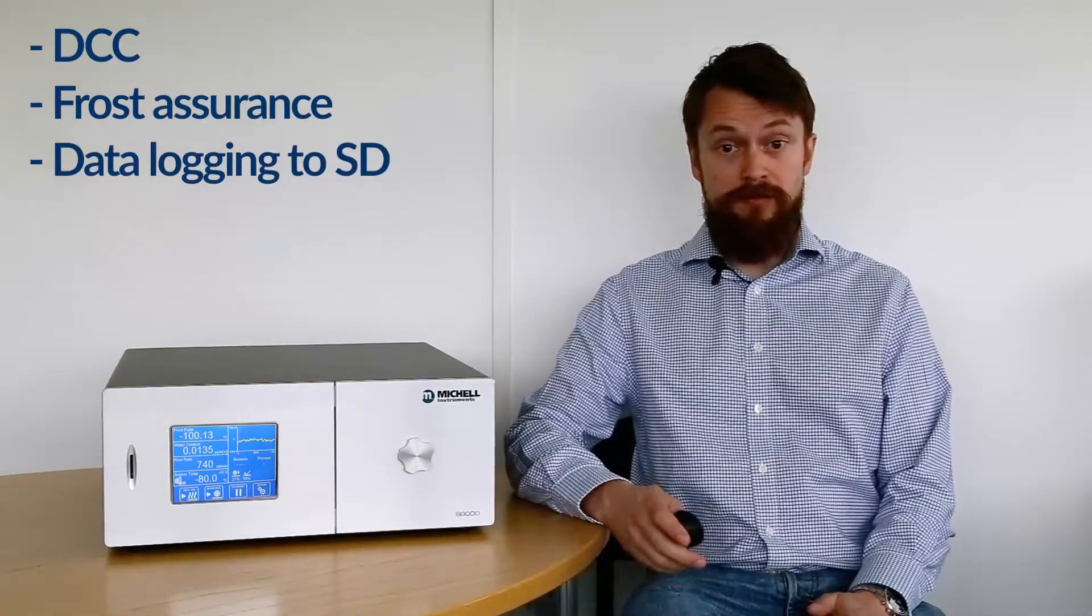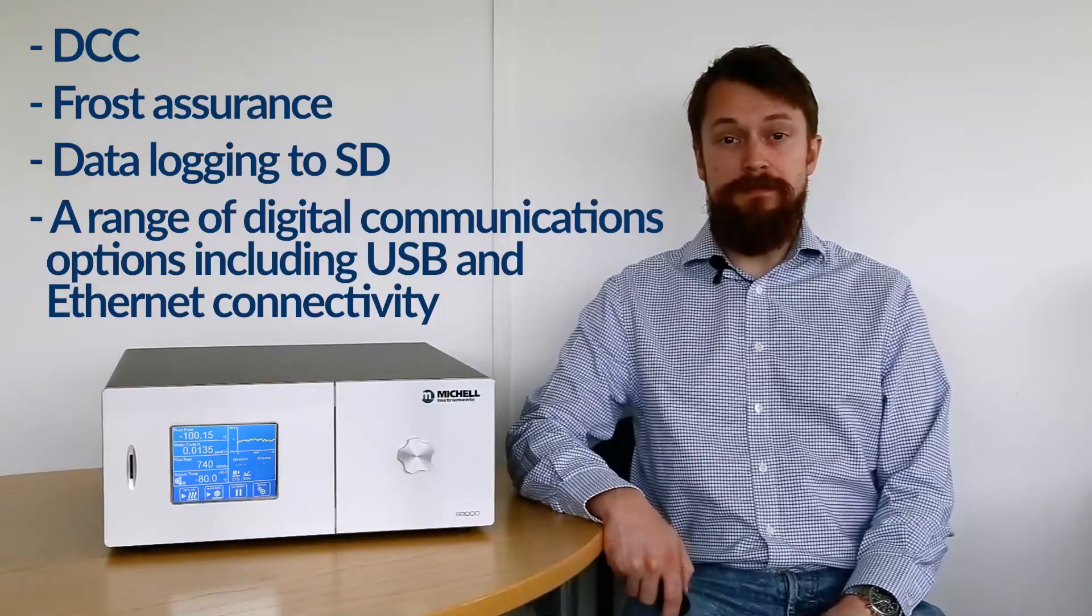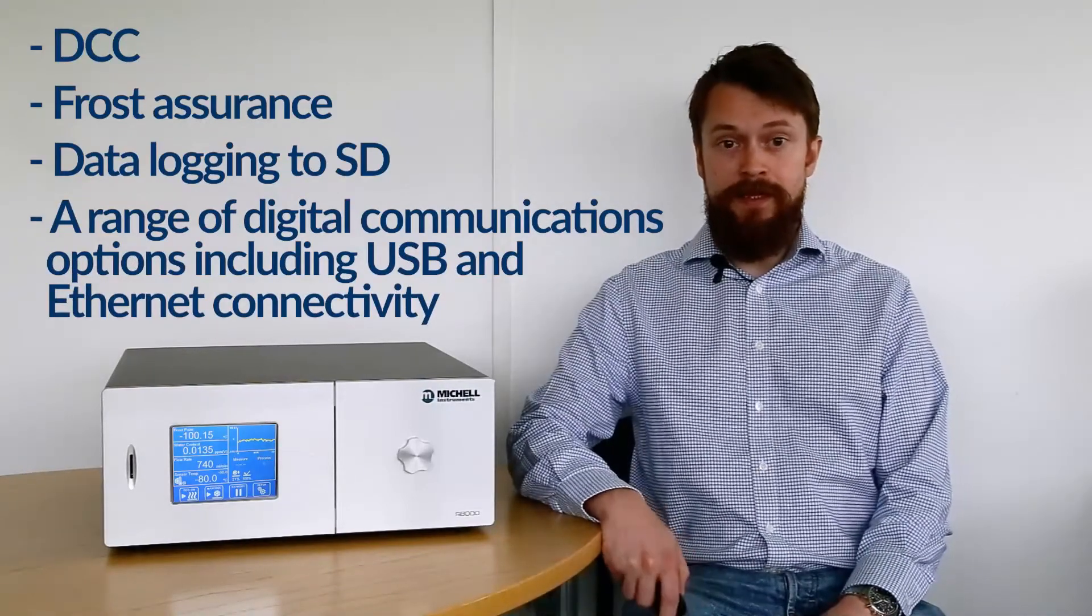The instrument also includes all the standard features found on the S8000 series like DCC, frost assurance, data logging to an SD card, and a range of digital communications options including USB and Ethernet.